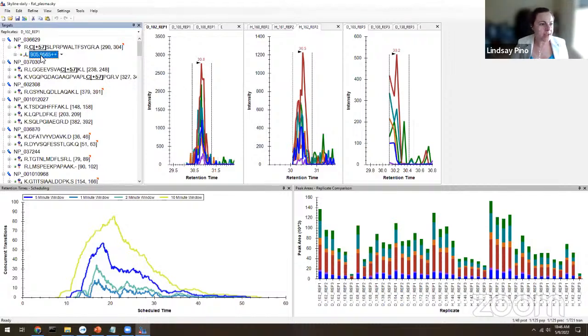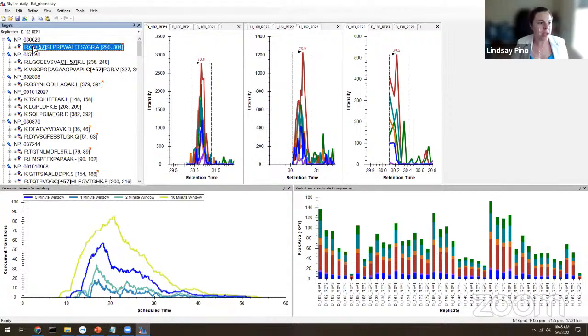Some more orientation. You may notice over in the target window, for each peptide sequence, there is a little P with what almost looks like an antibody underneath it. Some peptides only have the P with the little red antibody.